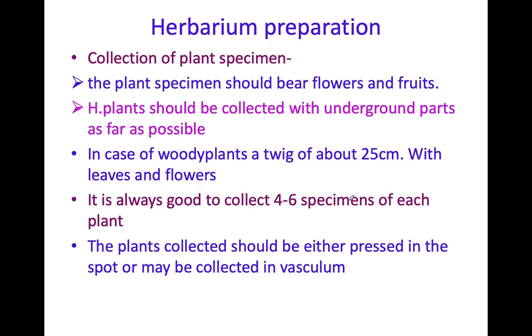Collection of plant specimens. The plant specimen should bear flowers. So you have to know how to collect the plants and which type of plants to collect. The plant specimen should bear flowers and fruits. It is compulsory.